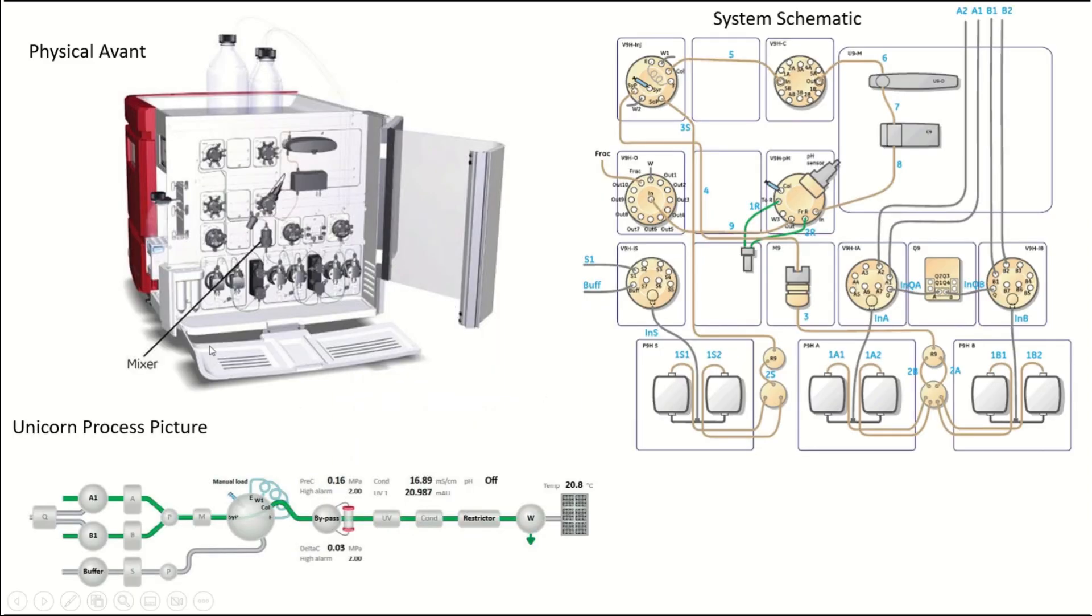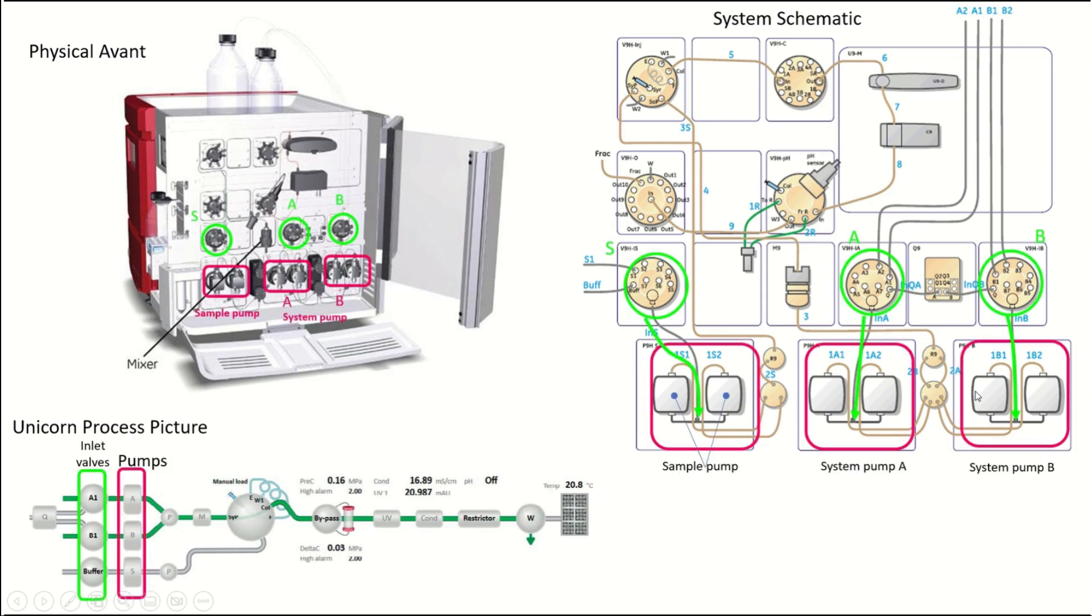Here's the physical Avant with the business end facing you, and to the right I've got a system schematic set up the same way as the physical Avant. Down here I've got the Unicorn process picture as shown in the systems control module. To start is the Q valve, which is in the middle. Honestly, I don't really use the Q valve, so I'm not going to talk about this today, but I just want to let you know it's there.